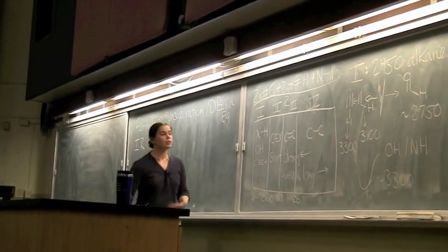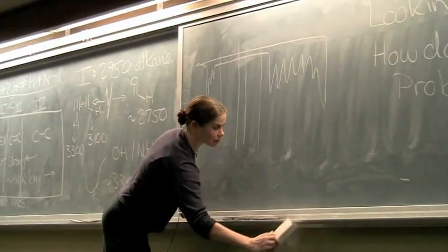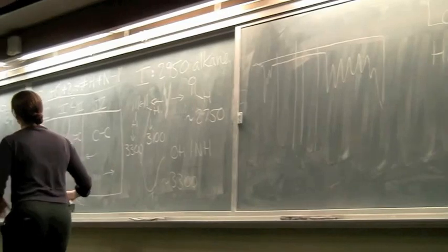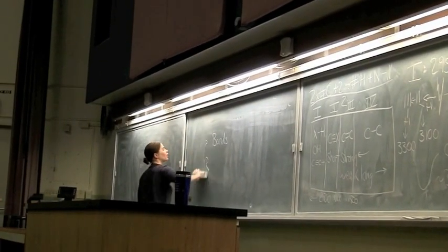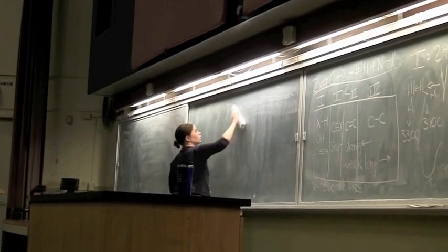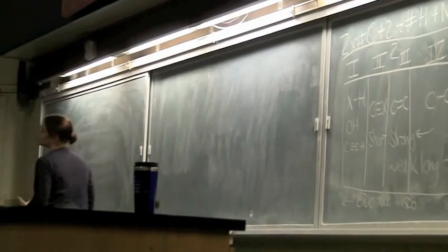So, similar patterns for the proton NMR. I'm not going to give you every single chemical shift there is. There's not really much point in me just wasting your time doing that. We've got more interesting things to talk about. But within that region, there's a couple of general patterns that can make knowing those numbers a little bit easier.